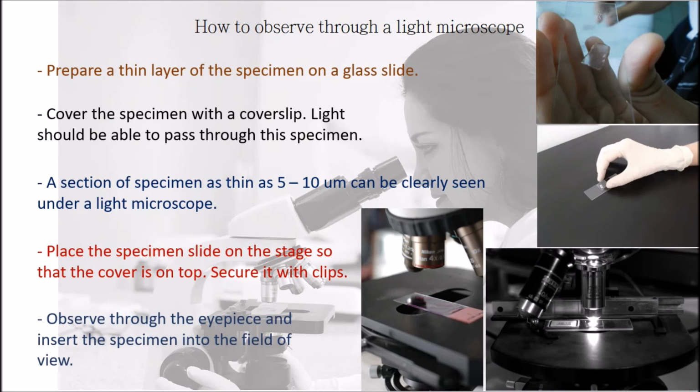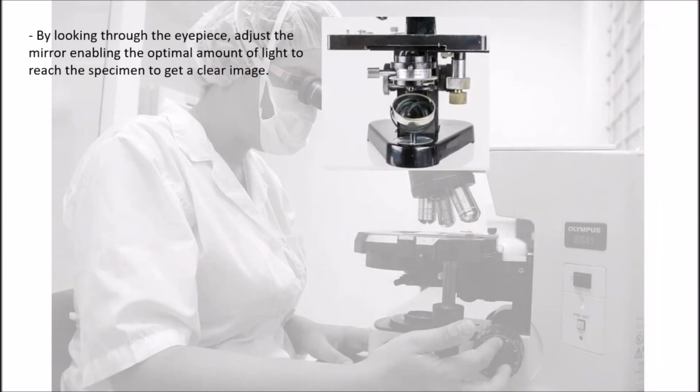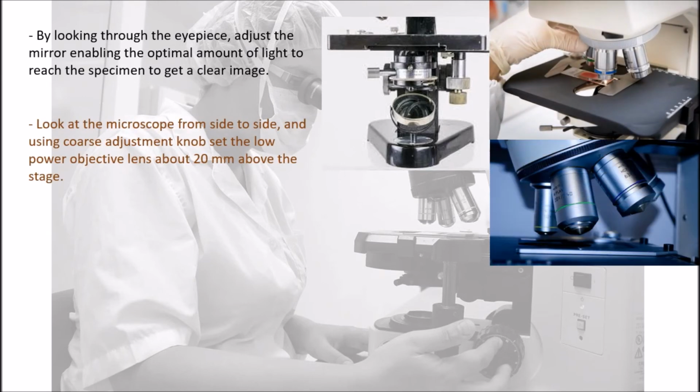Observe through the eyepiece and insert the specimen into the field of view. By looking through the eyepiece, adjust the mirror, enabling the optimal amount of light to reach the specimen to get a clear image. Look at the microscope from side to side and, using the coarse adjustment knob, set the low power objective lens about 20 mm above the stage.